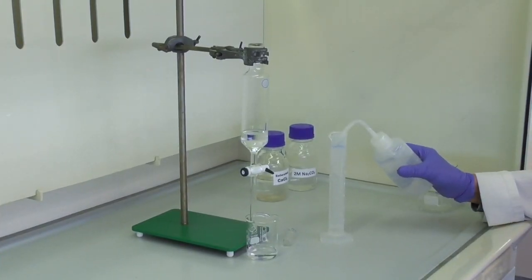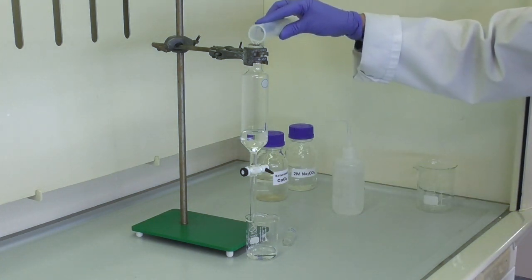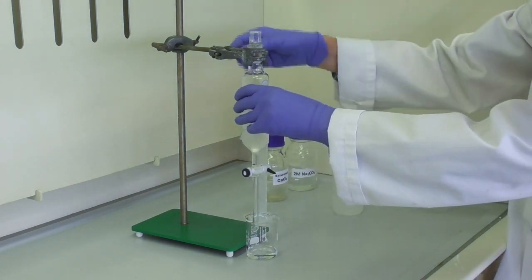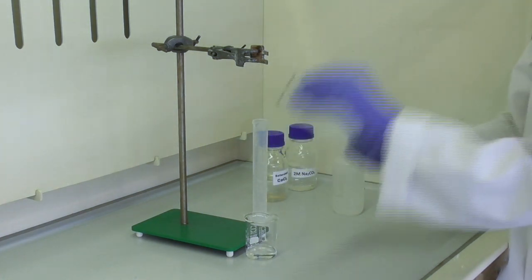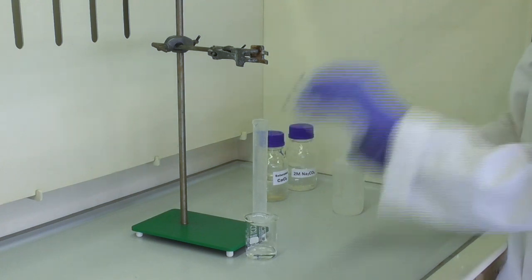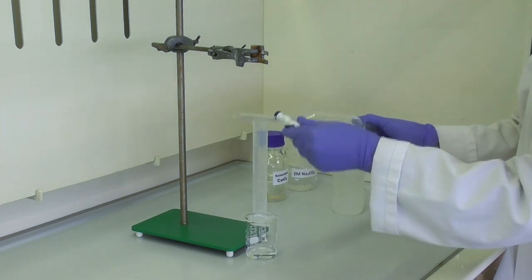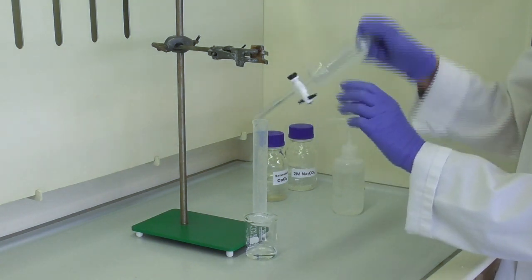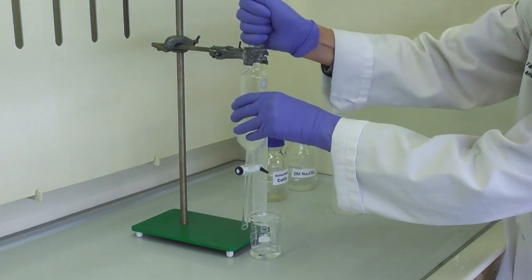The next step is washing the solution with 10ml of water, which we add to the separating funnel. Again, we shake this one, opening the tap frequently to start with, then just shaking it vigorously. This only requires a minute or two of shaking and the wash is complete.